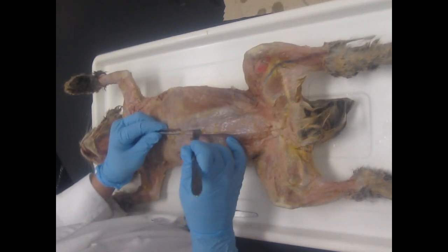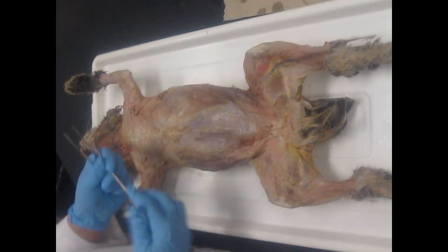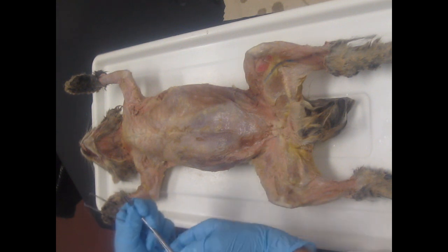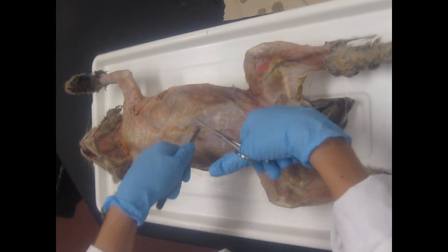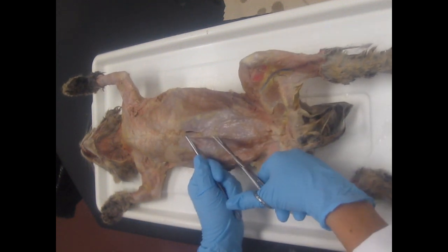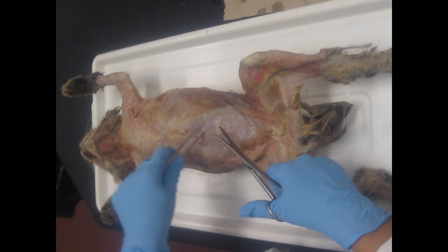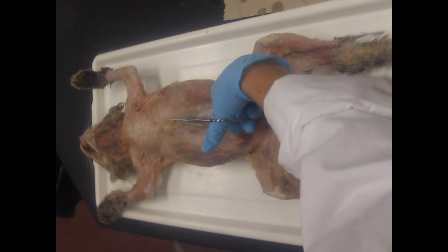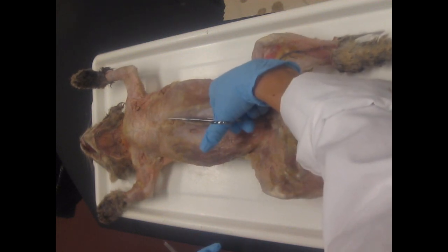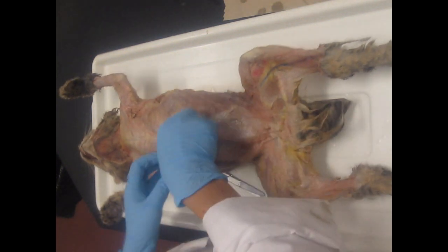You're just going to make an incision through the muscular wall, just large enough to get your scissors through, because scissors are going to be better than a scalpel. If you have a blunt edge, it goes towards the organs. Now you're going to lift up the abdominal wall, because you don't want to be cutting through organs. So lift up, insert the scissors, and whenever you're doing incisions against organs, lift that tissue so that you're not cutting through organs. Now you're going to go high enough to where you meet the diaphragm.